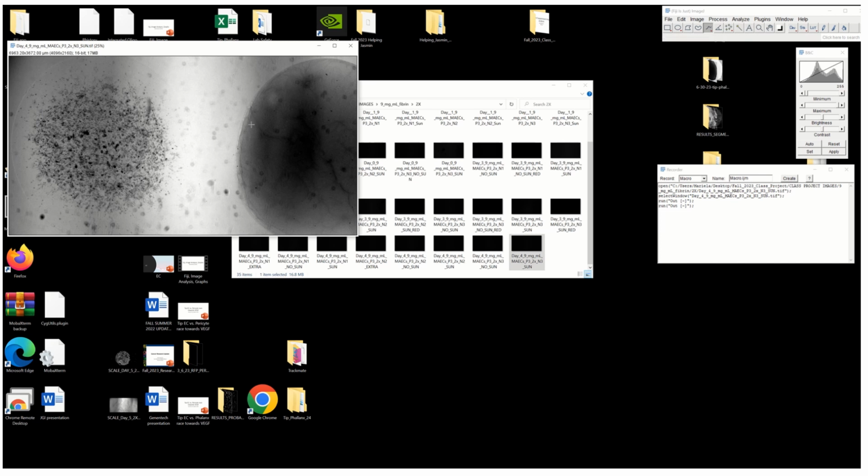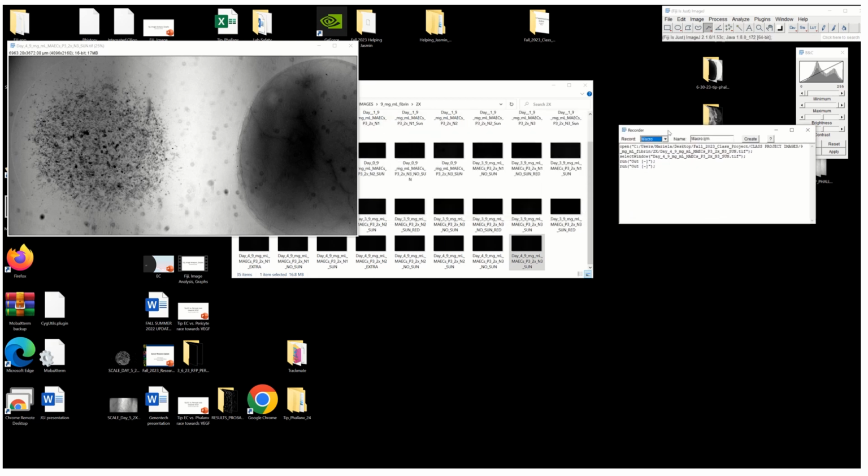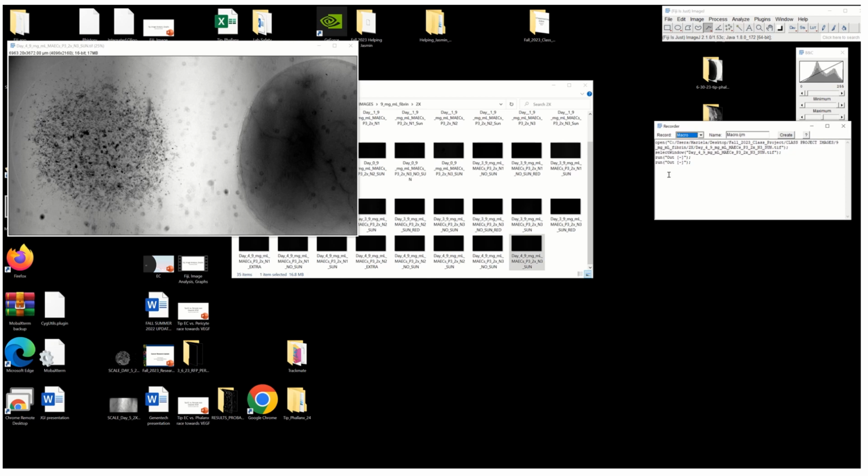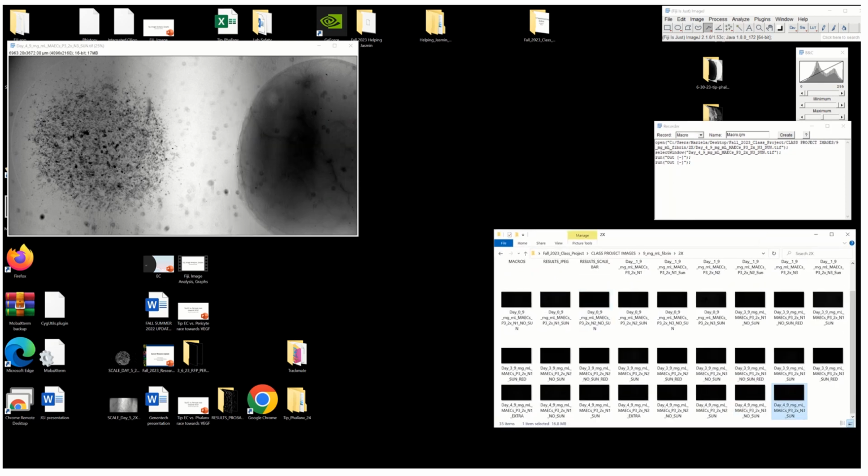Every button that you press, Fiji will convert into a line of code in that IJM Fiji language. So we're going to record all of our steps, and once we have the code that we want, we'll copy and paste it into our coding block, which is down here.